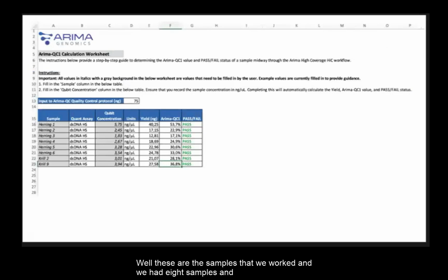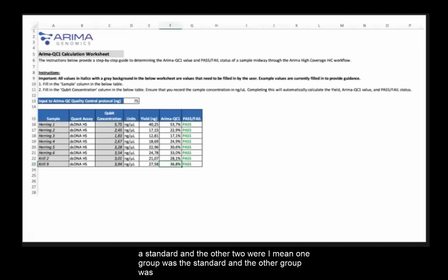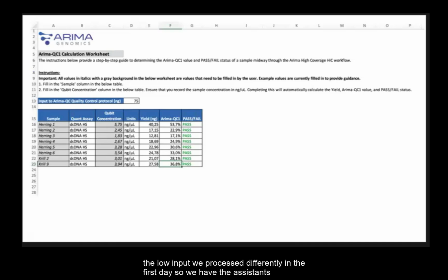We had 8 samples, and they were divided into 6 of standard input amount, and 2 of them, the krill, were supposed to be a low input amount, but it was similar to the other. Because one group was the standard and the other group was the low input, we processed them differently in the first day.